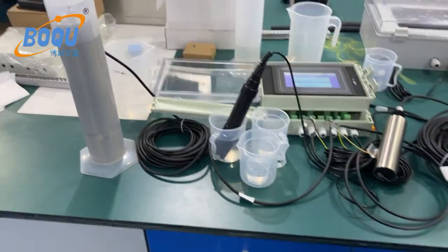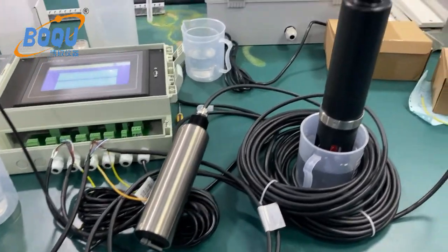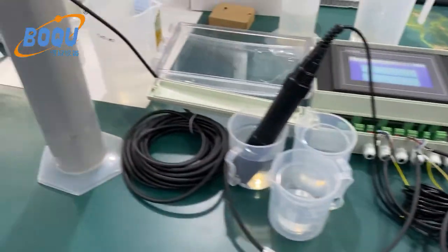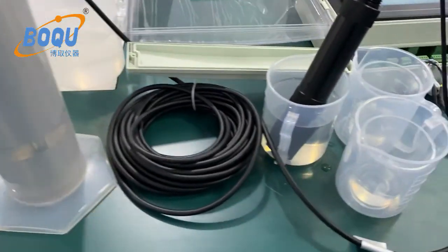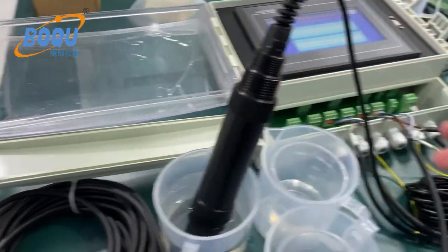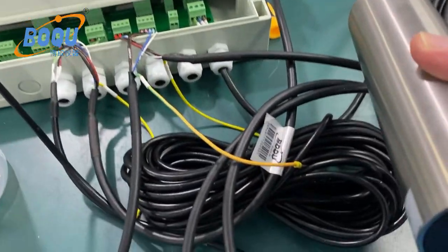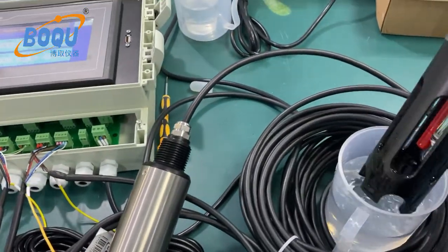This model measures COD, pH, suspended solids, and ammonium nitrogen. Here is the sensor: a COD sensor, a pH sensor, a suspended solids sensor with AutoClean wiper, and an ammonium nitrogen sensor.